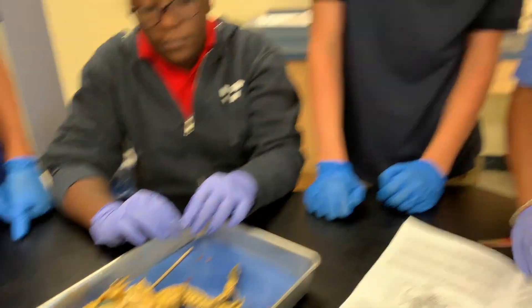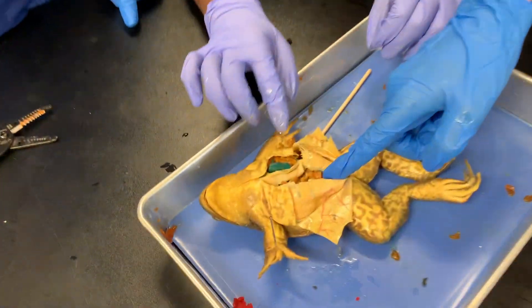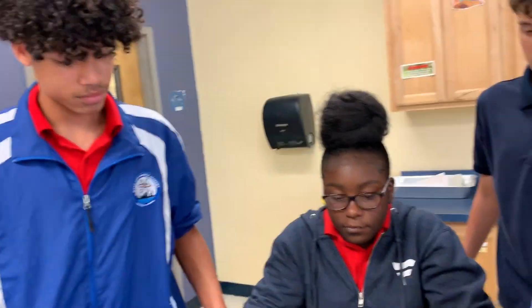The first things we're going to look at are called fat bodies. Do you see any yellow, bean-like, greasy-looking things in there? What is the fat in our bodies for? To keep us warm — and we store energy there, right?